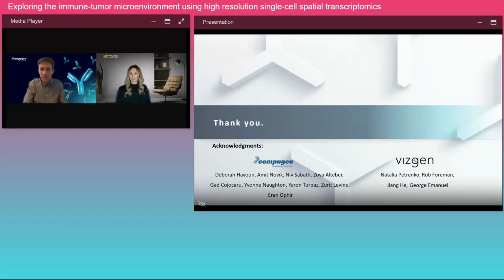Nowadays, when we receive the data from Vizgen, from MERSCOPE, they're using the latest algorithms like CellPose2. So it's improved greatly. So it's less of a challenge. But I can say that we still do some quality control over the segmentation. And when we see that we have issues or we don't have to use a single cell resolution, we can use things like divide the tissue into polygons, and then you don't have to rely on the segmentation. You can just look at different regions and compare them. So it all depends on the question, but it's something we developed some solutions, still working to improve.